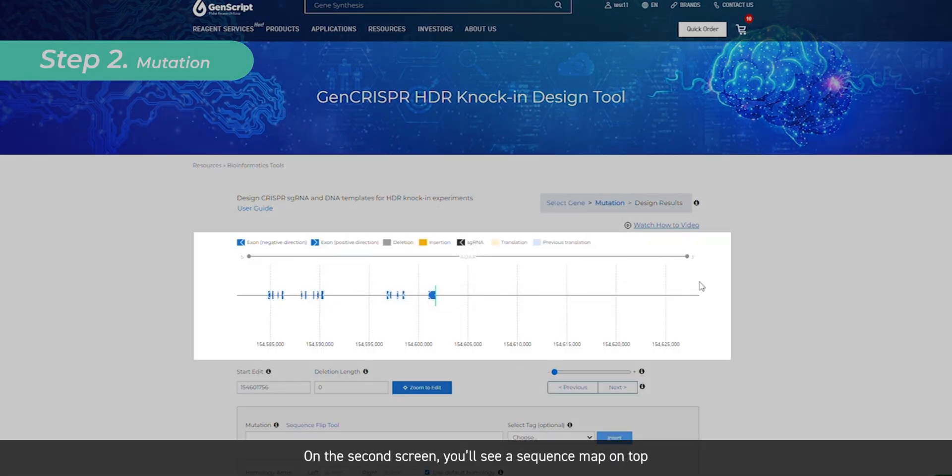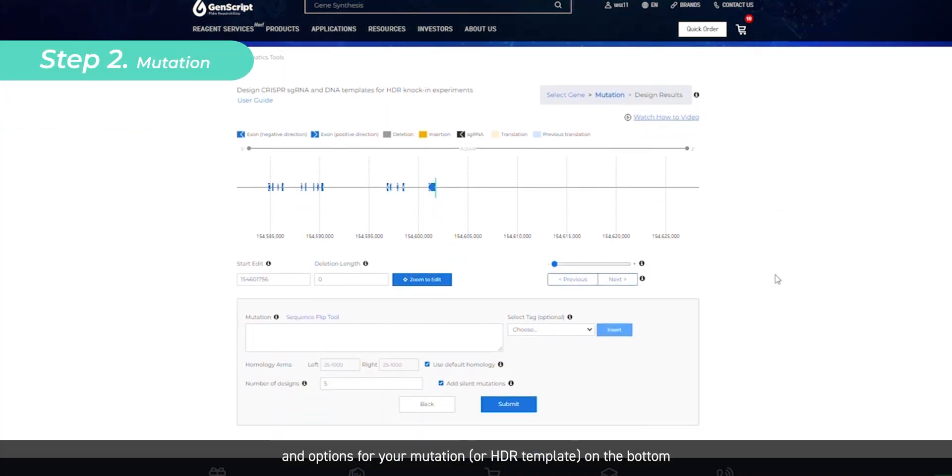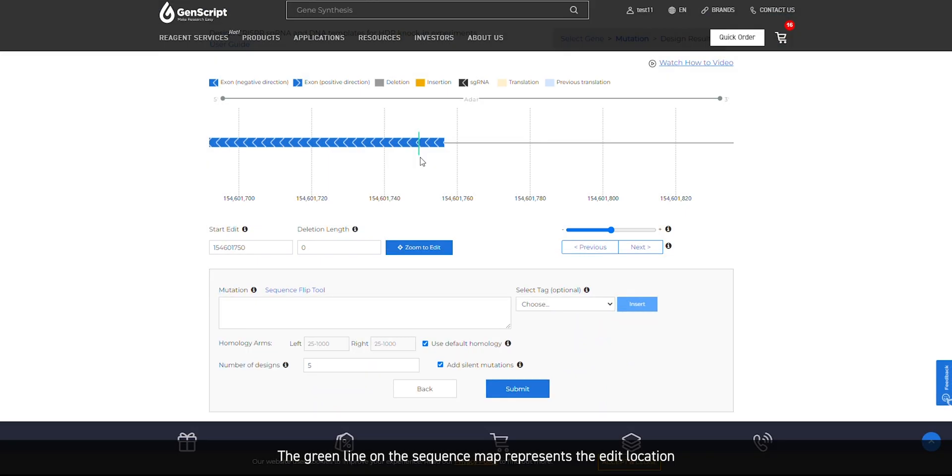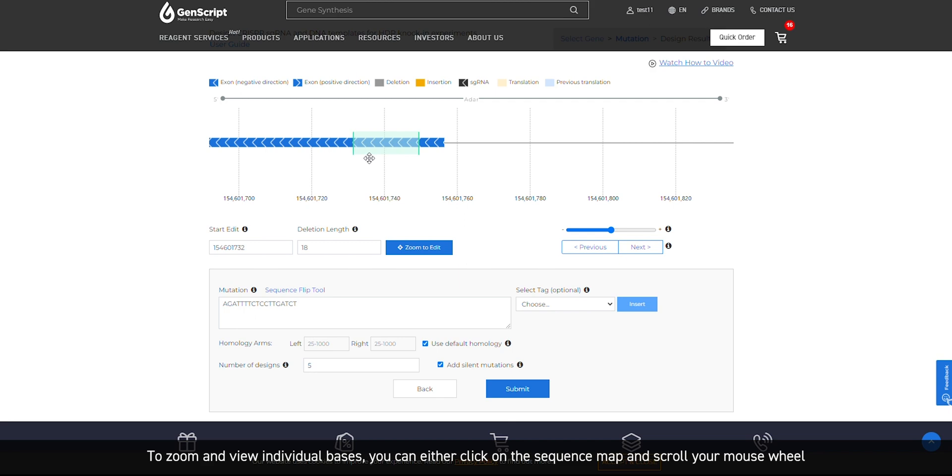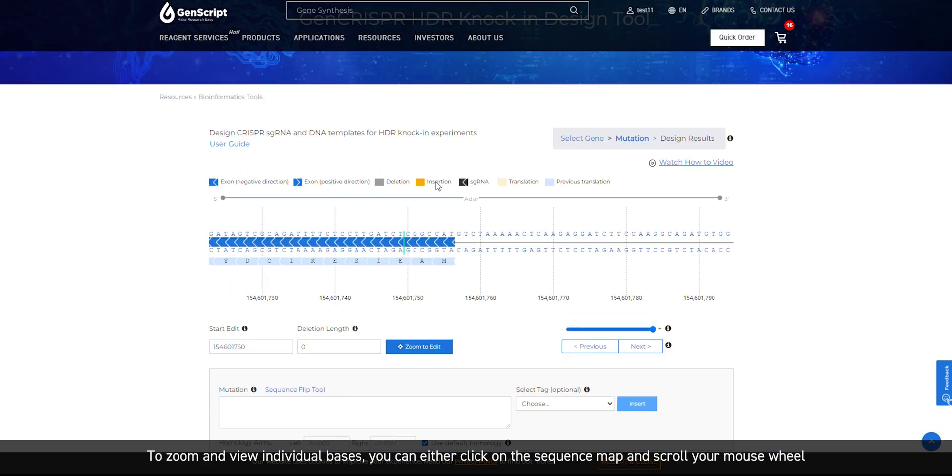On the second screen, you'll see a sequence map on top and options for your mutation, or HDR template, on the bottom. The green line on the sequence map represents the edit location. You can move this line by clicking on it and dragging it to your desired edit location. To zoom and view individual bases, you can either click on the sequence map and scroll your mouse wheel, or simply click the blue Zoom to Edit button.